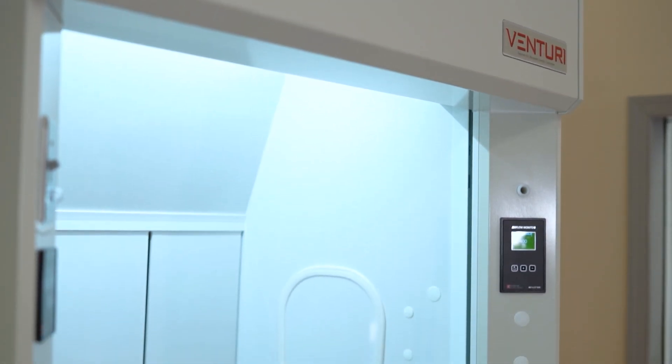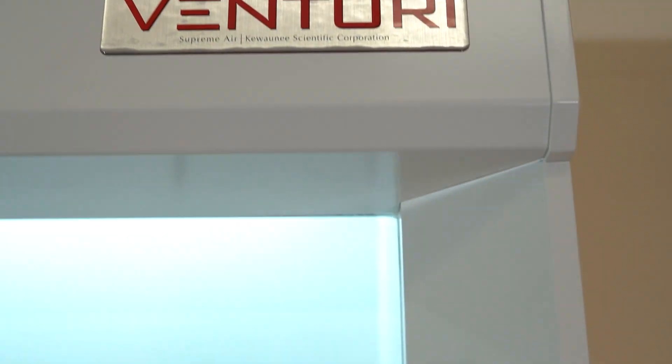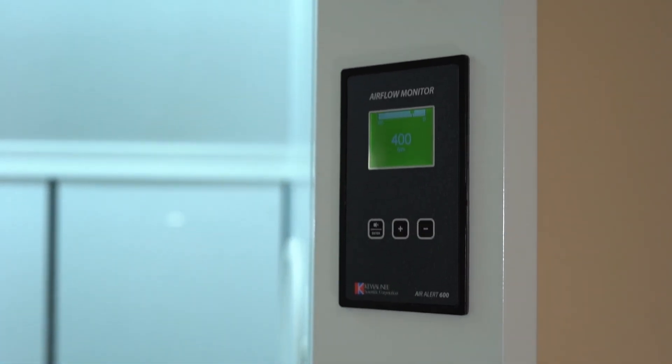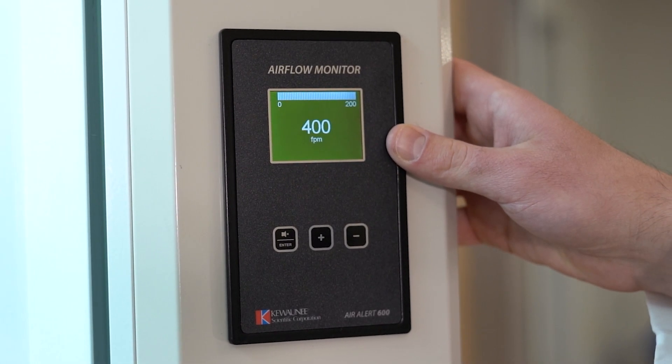The Air Alert 600 is a fume hood airflow monitor that's available on Kiwani's Supreme Air fume hoods. Let's quickly explain the equipment.